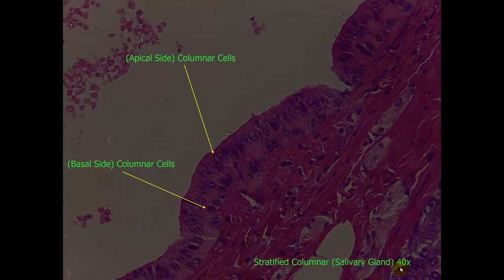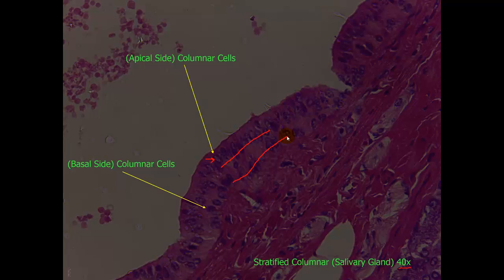On a 40x objective magnification, we can clearly see the individual round nuclei, and we can see the different layers. Here is the first layer, and here is the second layer of the columnar cells. This is the apical side, and then at this edge, we have the basal side.